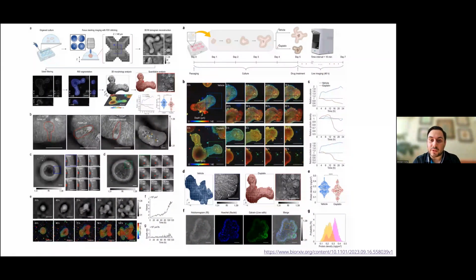What is the minimum difference in refractive index that the Tomocube is able to detect? Okay, I think this is a very important question about our features. We can detect, we say the sensitivity, how sensitively we can distinguish between index changes. Our sensitivity is 10 to the minus fourth, 0.0001. I think this is very sensitive to detect small variations in space and time.